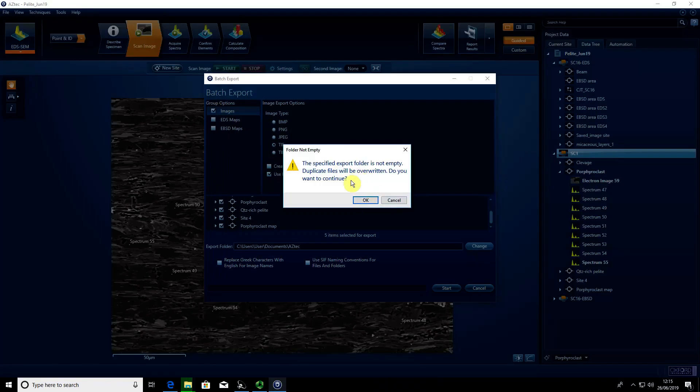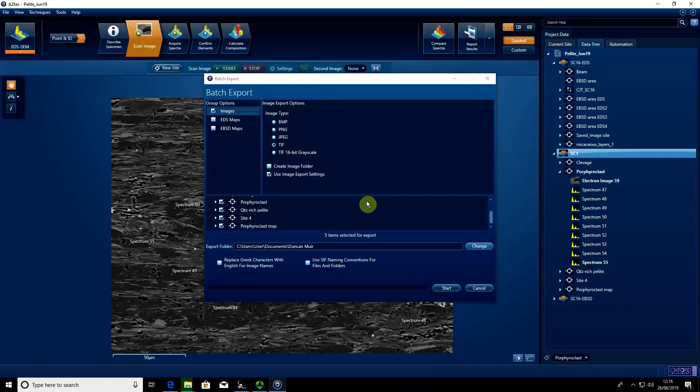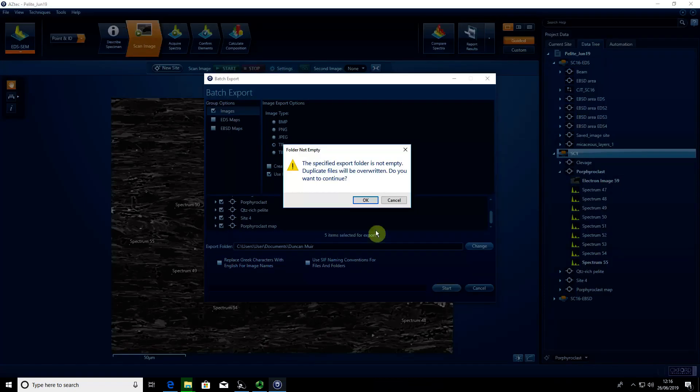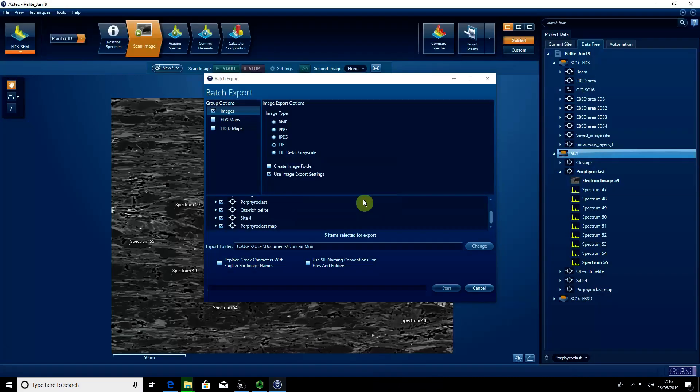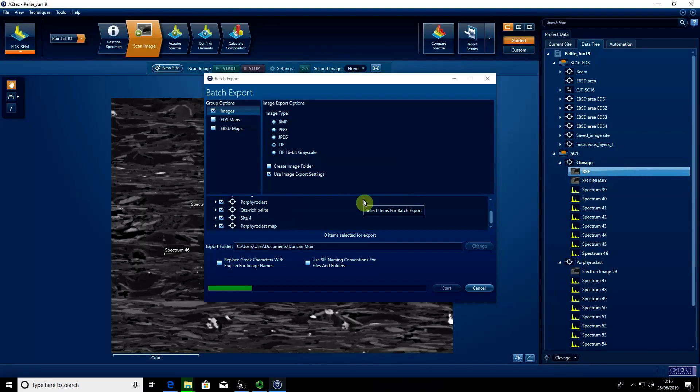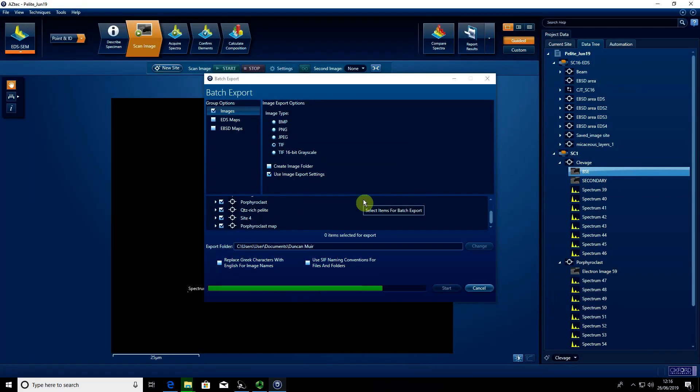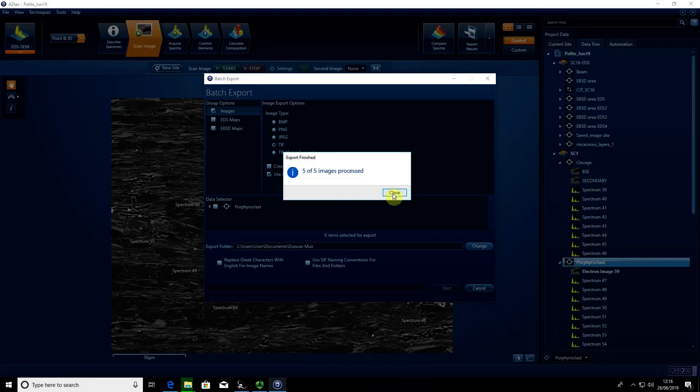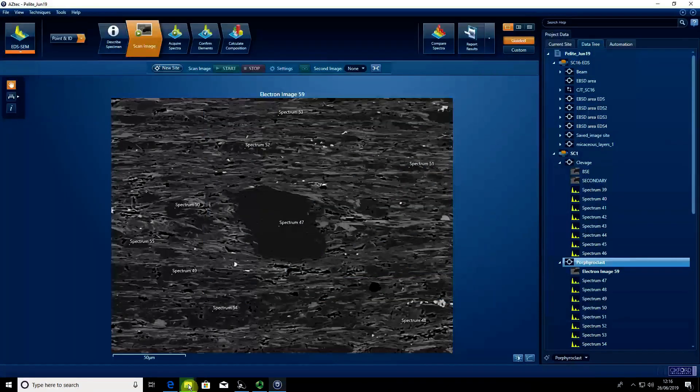It's warning that there are other TIFF files that may be overwritten. I'm not worried because it will give the name of the actual electron image as it exports. We can say start. Again, it's warning about overwriting existing data, but that's fine. You can see it starts to cycle through and export all these images. Five images were exported.